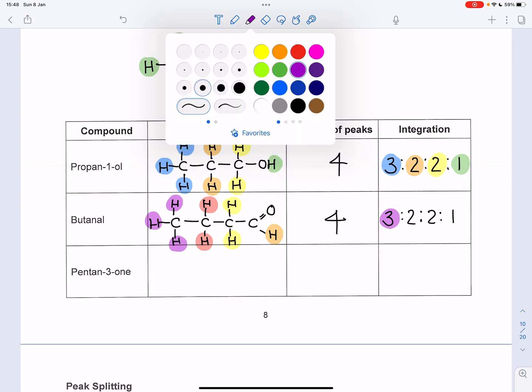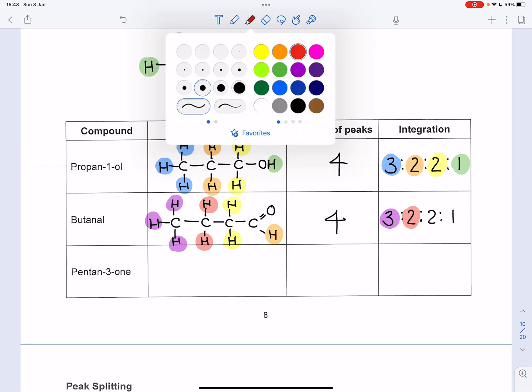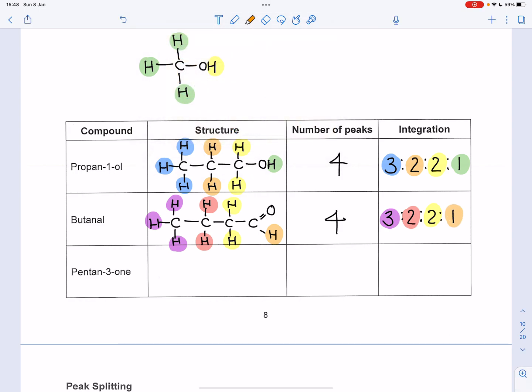These 2 spectra then we may think, well, these are going to be identical. We're not going to be able to tell them apart. But we are going to be able to tell them apart because they've got different types of carbon. An alcohol carbon is very different to an aldehyde carbon. And so we're going to be able to tell the hydrogens on those carbons apart from their locations on the spectra, so their parts per million values.